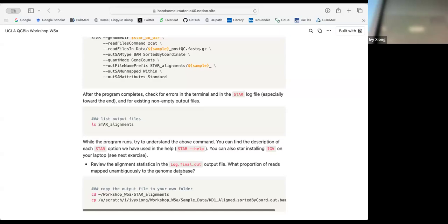So gzip this, and then you run it through fastp. You write this compressed. They're the same file, one is compressed and one is not. You have to always enter the right file. You can't do the operation on something that is not compressed. So that's that one, and then choose it.